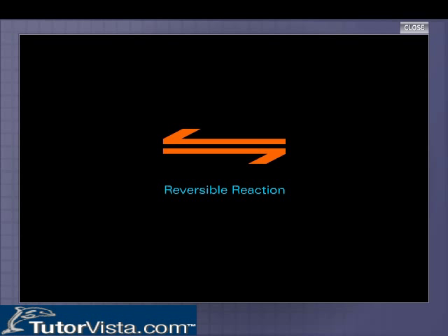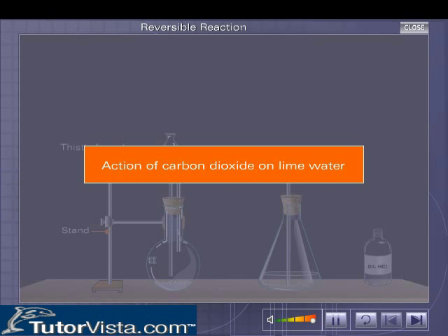Reversible Reaction. Let us study the action of carbon dioxide on lime water.